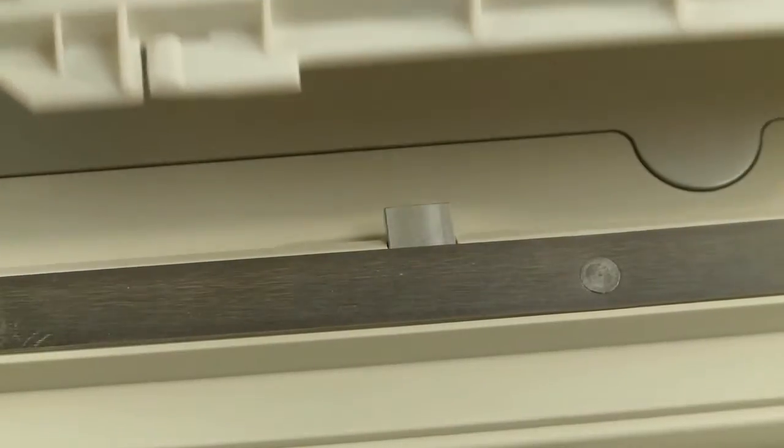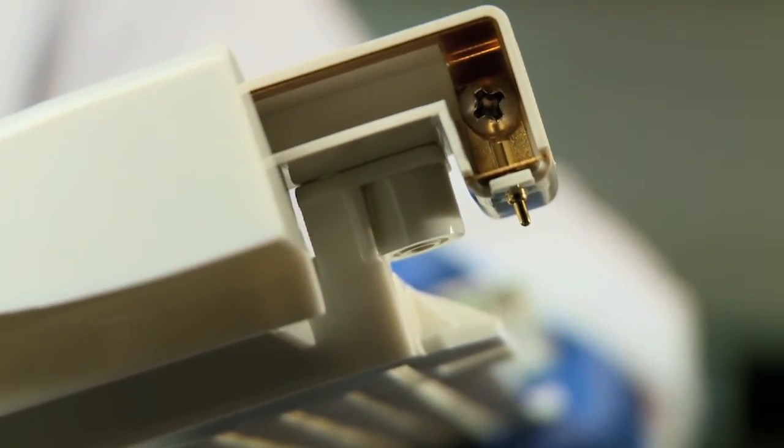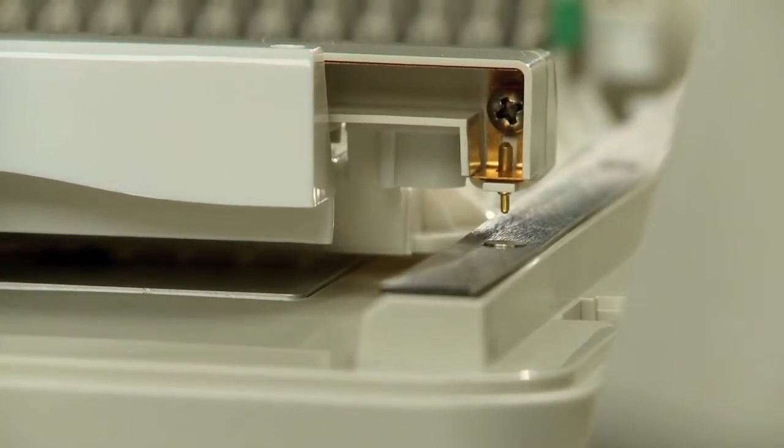Press the tray into the instrument until the stop on the tray is reached. Check to make sure that the pin on the negative electrode assembly has made contact with the metal strip on the instrument.